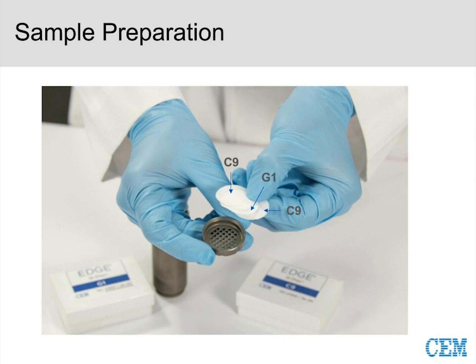The reason we are using the C9s in this case is to add support to that G1 Q disc. We have a very robust set of filtration going on. If you can kind of go back to all of those types of foodstuff we looked at, from the nuts to the honey and so forth, you can see that the food varies dramatically from dry to wet.